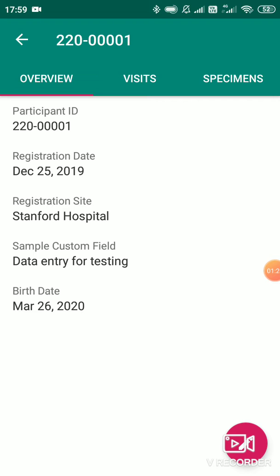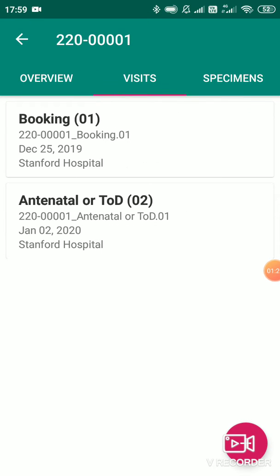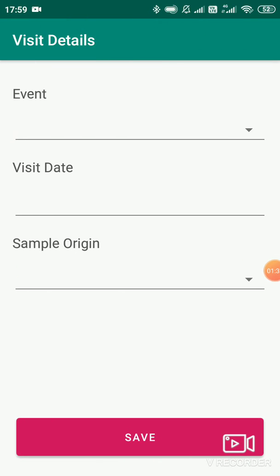After the participant overview, we're moving to the visits. Just swipe right so that you can go to the visits tab. Here also you can click on the plus sign and do data entry for the visit fields. The fields can be modified as per your requirements.